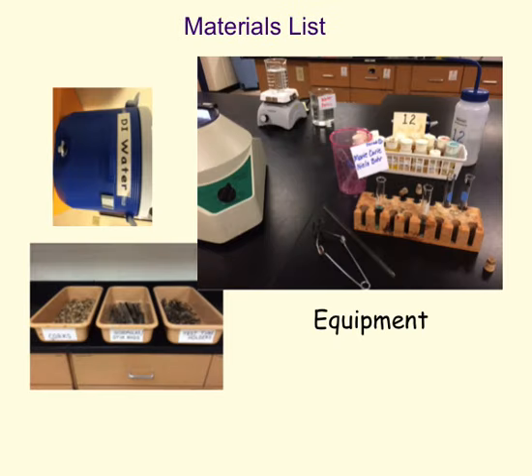And then the rest of our equipment: each day, you're going to go to the designated area where the cups are stored, grab your cup that has the test tubes in it, and head to your station. So you'll have a station dedicated to your area of work. At each of these stations, you've got a test tube rack to do your work with. You're going to have your test reagents. Then you're also going to have a DI water bottle.